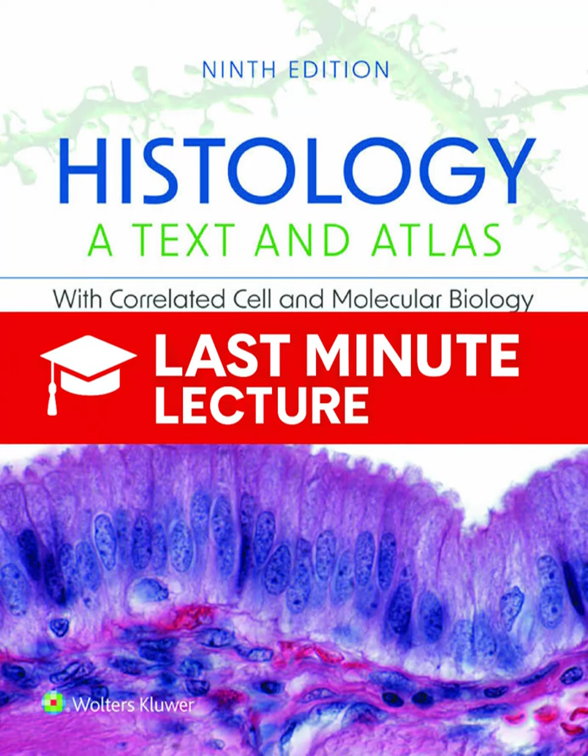And how can a scientist be absolutely sure they're staining the right thing? With enzyme digestion controls, it's a critical step. For example, if you see PAS staining and you think it's glycogen, you could treat a control slide with an enzyme like diastase or amylase before you've stained it. And if the staining disappears, then the enzyme digested the glycogen, and you've confirmed its identity. Similarly, you can use DNase to abolish Feulgen staining or RNase to get rid of the basophilic staining in the rough ER. These controls are essential for rigorous science.